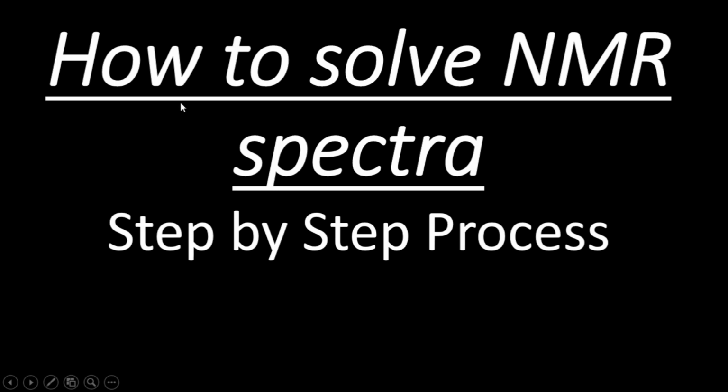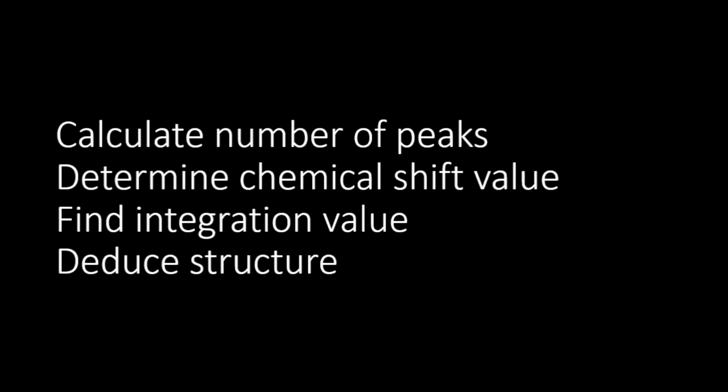Today in this video we are going to study how to solve NMR spectra. We will study how to solve NMR spectra in a step-by-step process. Here, as you can see, the four steps are given. This is the first step. This tells us to calculate the number of peaks given in the NMR spectrum.